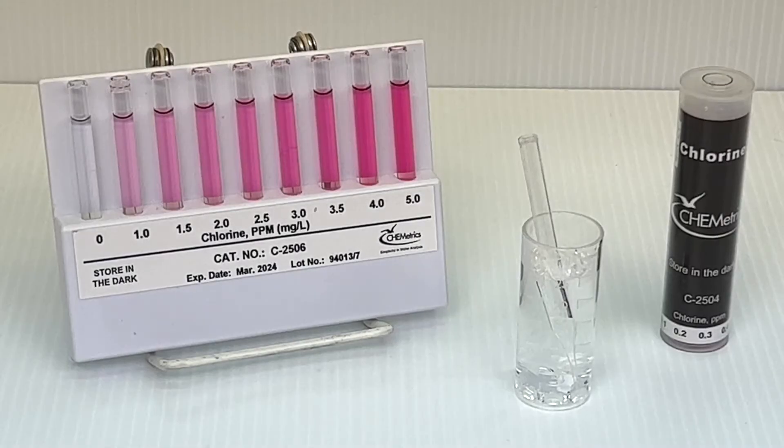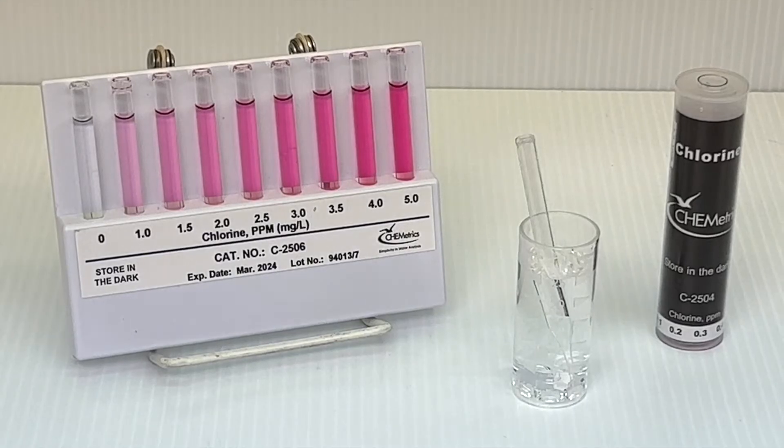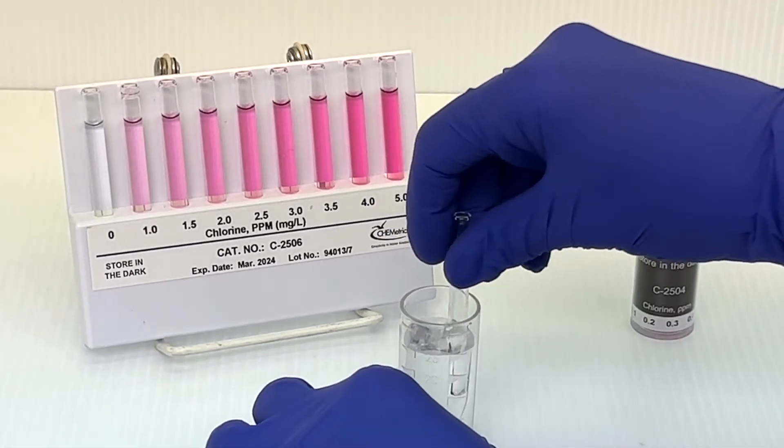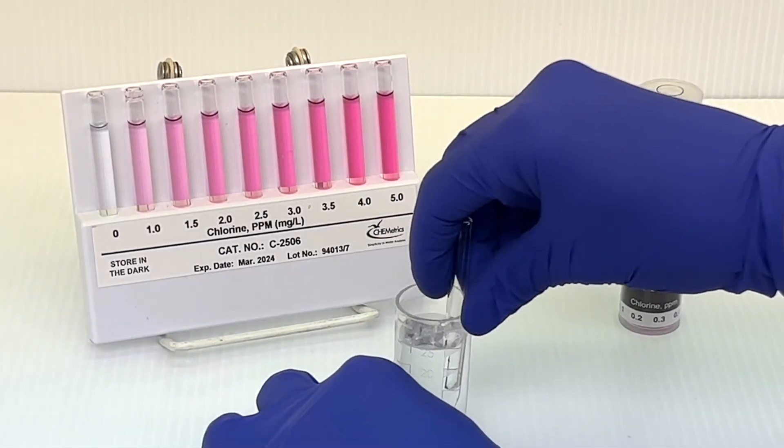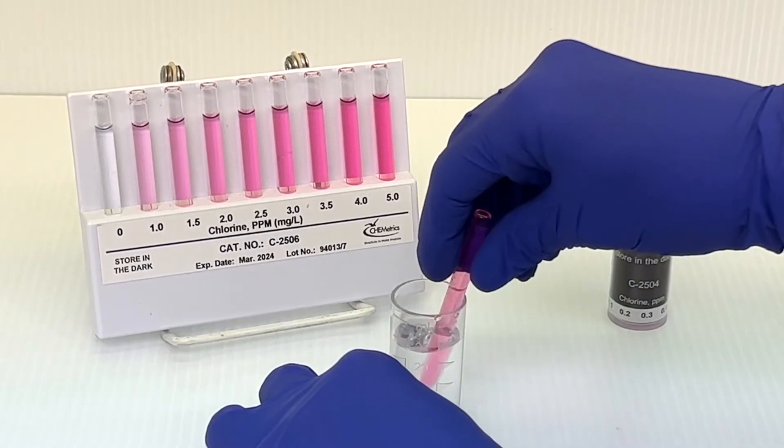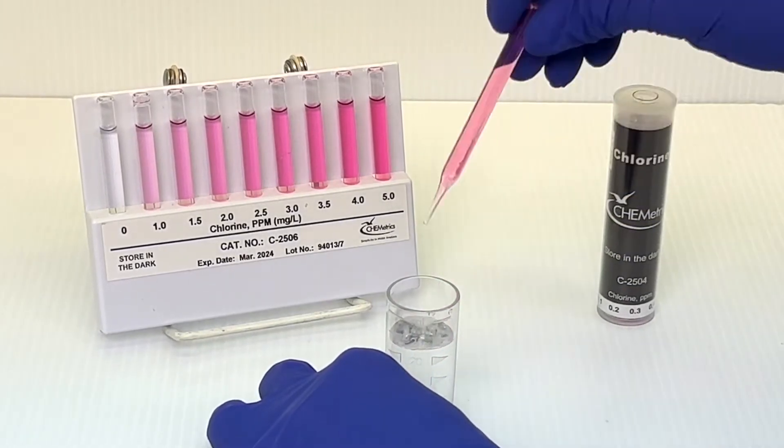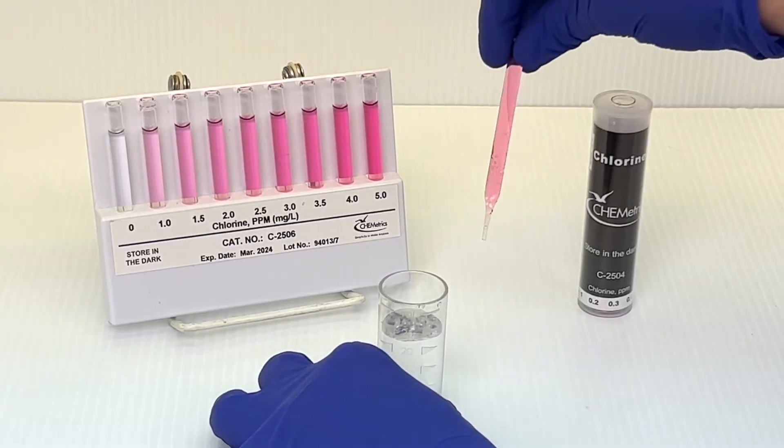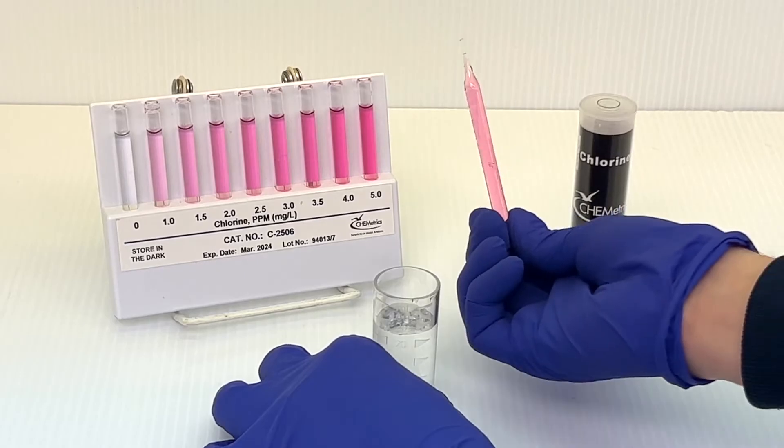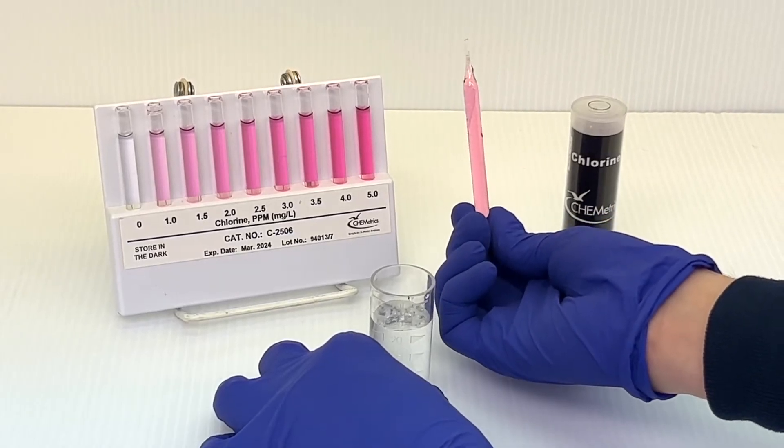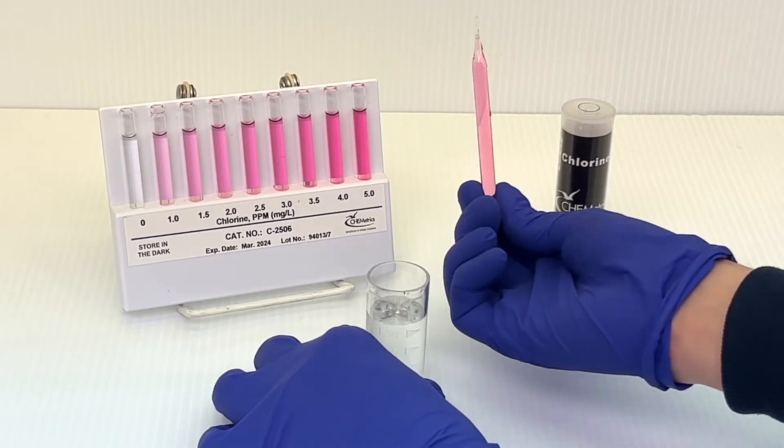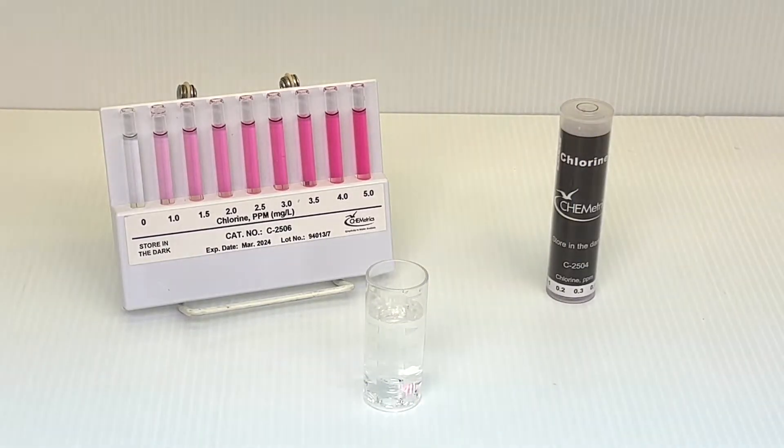We'll tell you more about how each of these comparator styles are read in a minute. First, some background. Cometrix comparators are specially manufactured to match the color, or hue, as well as the intensity of Cometrix test ampoules that have been snapped in various samples—that is, in solutions of corresponding analyte concentrations. By sealing our dyes in ampoules, we're able to closely recreate the color generated in the test ampoules.